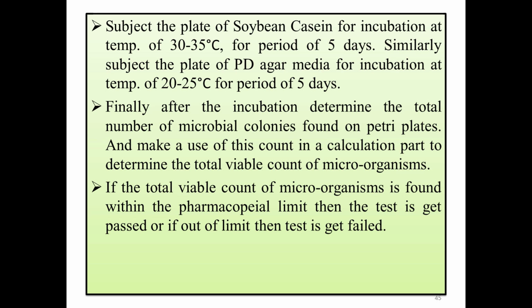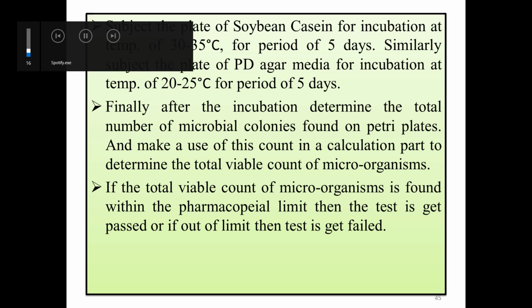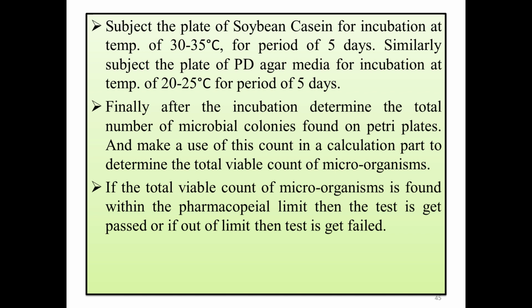present on the petri plate. What we have done is incubate the nutrient media, which have the parts of filter membranes containing the sample. If there is any presence of microorganism, then colonies will appear on the petri plate.